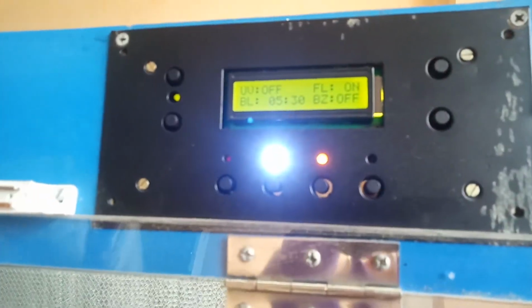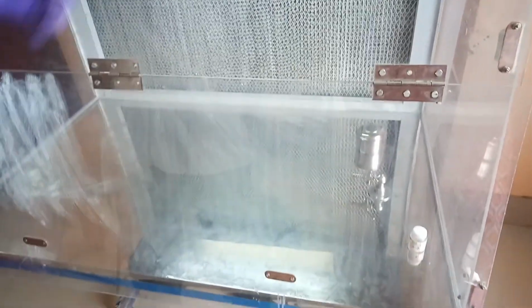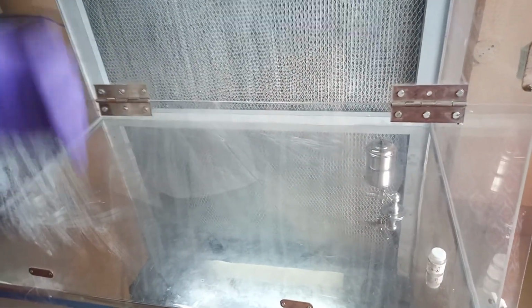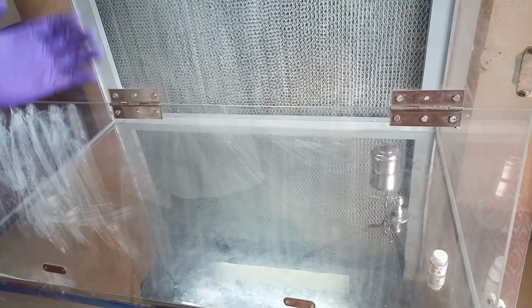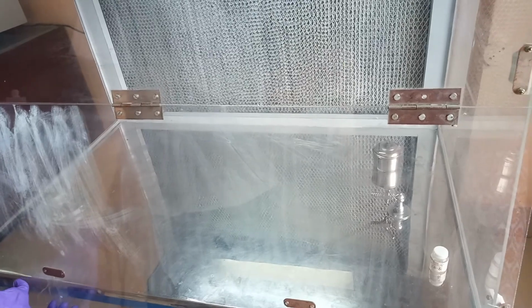The fluorescent light is on now, and along with that we switch on the blower. When we switch on the blower, any particle that is present inside will get blown out. So there will be a laminar flow of air inside. That is why it is called laminar airflow. And after that we open the hood.